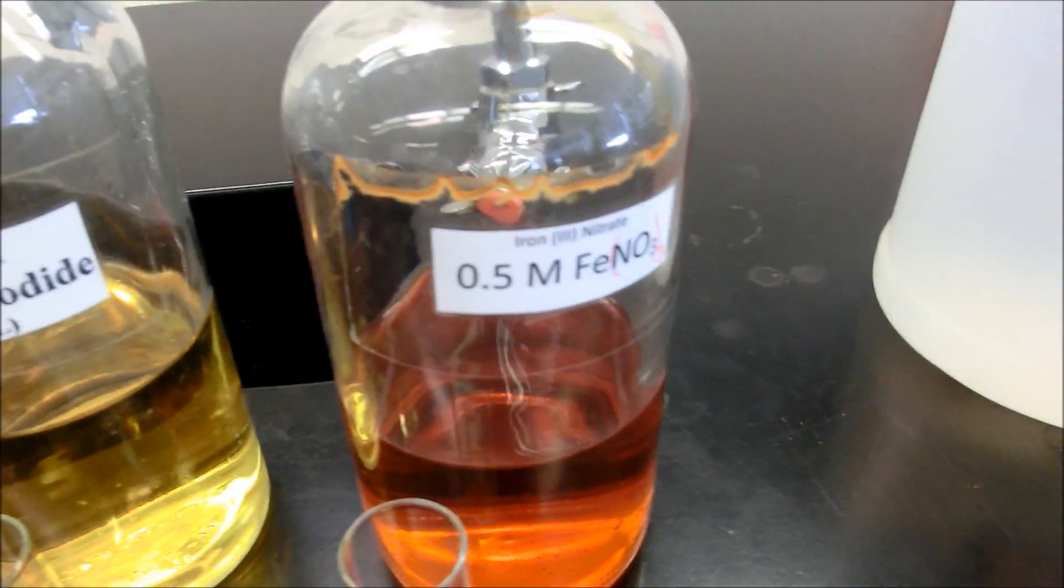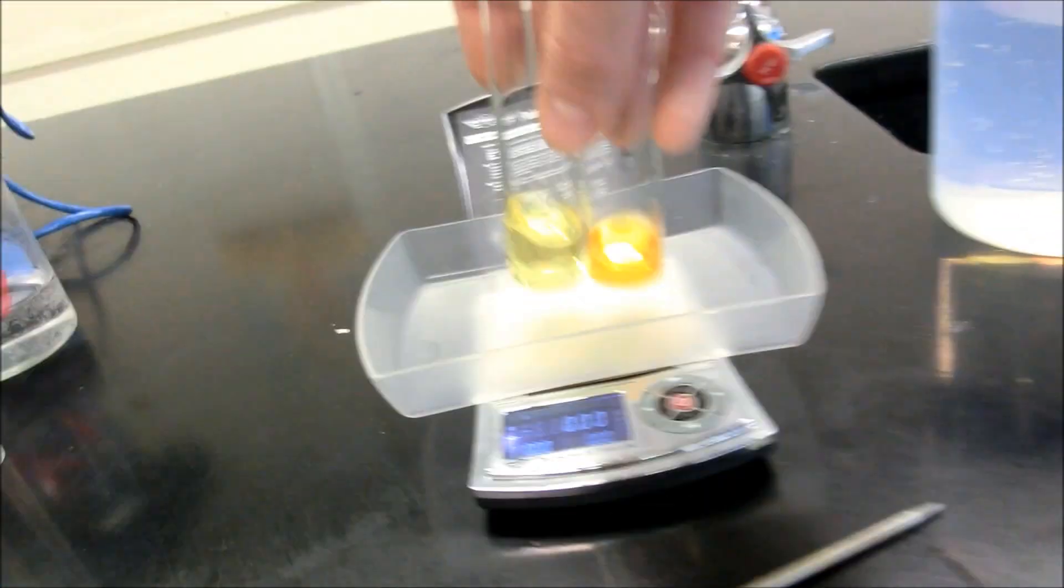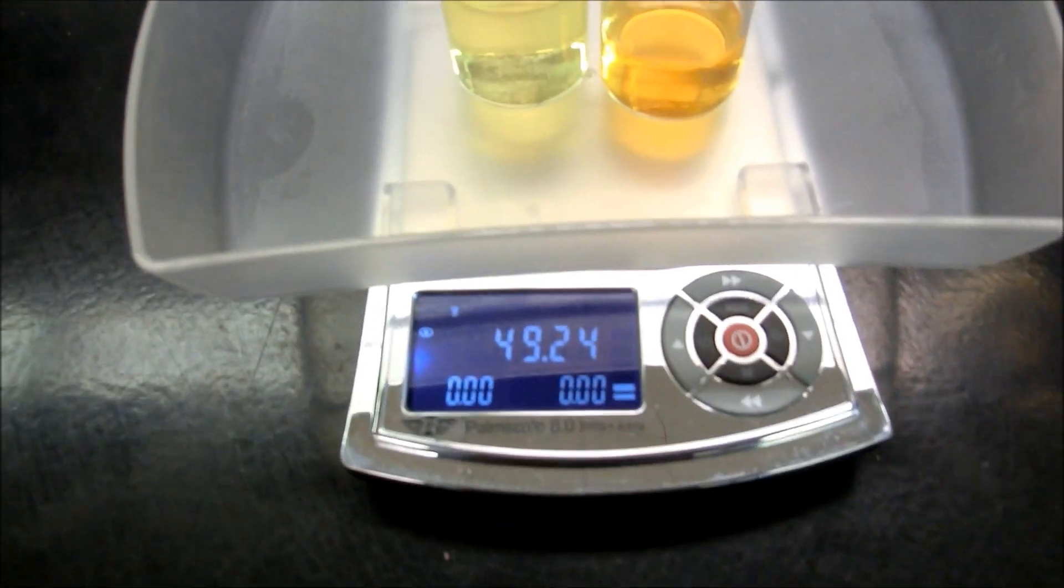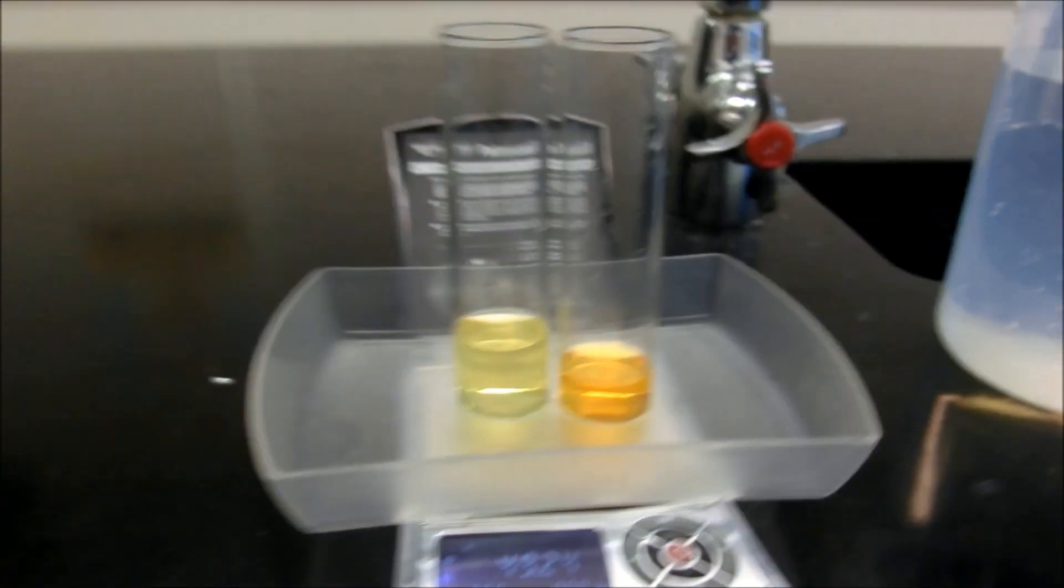Potassium iodide and iron-3 nitrate. Poured some of each of those into those containers together. Combined mass of those two is 49.24 grams.